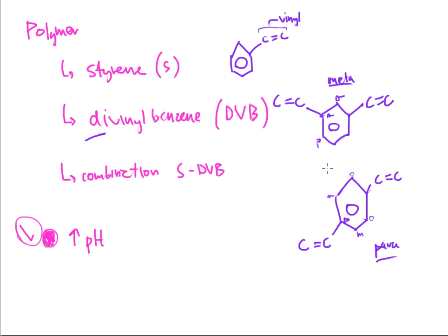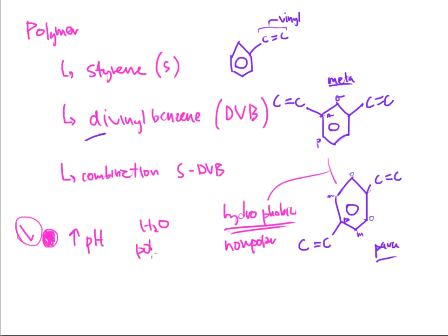The issue is that these groups, especially in a polymer, are hydrophobic. They are organic, and they are mainly nonpolar. And we know that polar and nonpolar don't mix. So I've got water, and this water is going to be polar. And I'm going to expect that water to associate with the particle. And the particle's nonpolar. It's not going to keep that water around. If it doesn't keep the water solvent around, it's not going to keep the ions around either, whether it's cation or anion. So there's got to be a way that we can maybe make this more friendly.